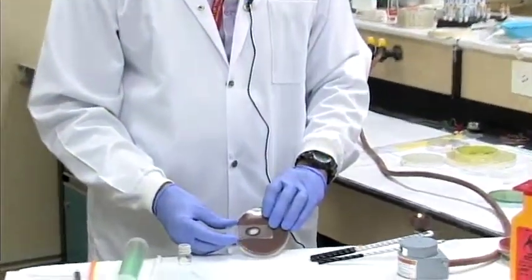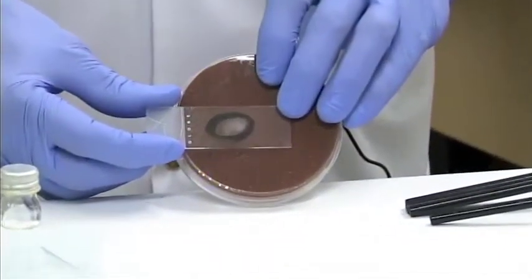So to continue the video for how to make a gram stain, we have done preparing our smear. Remember, we place our bacteria on our slide and we let it air dry. It's very important to let it air dry to make sure it's completely dried. How do we check to see if it's dried? You can look at the smear, put it against a background to make sure you see a nice film on it. There are no droplets, nothing wet on it.